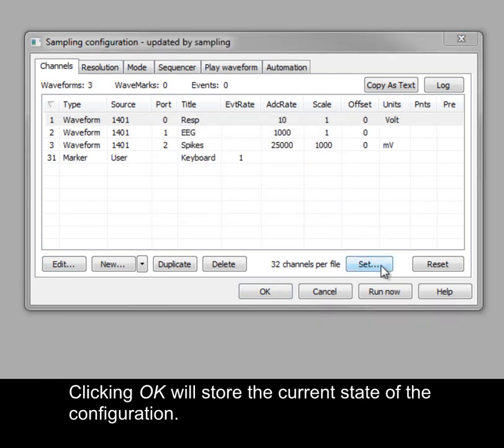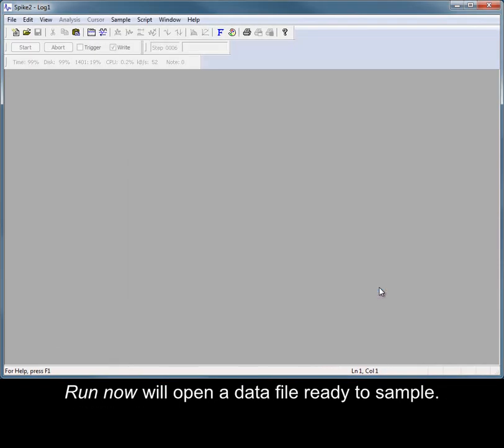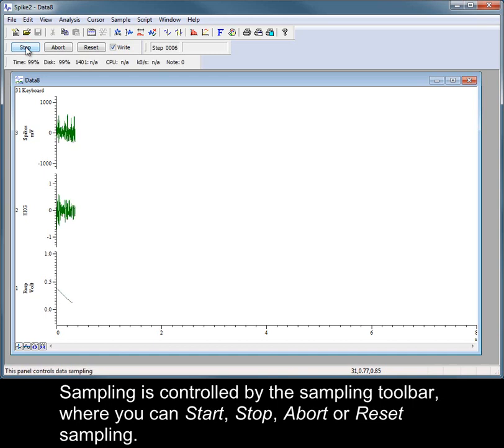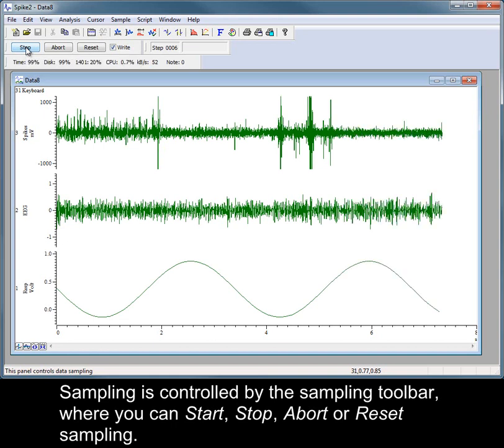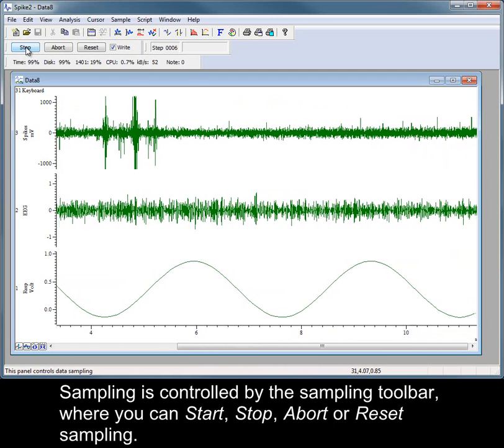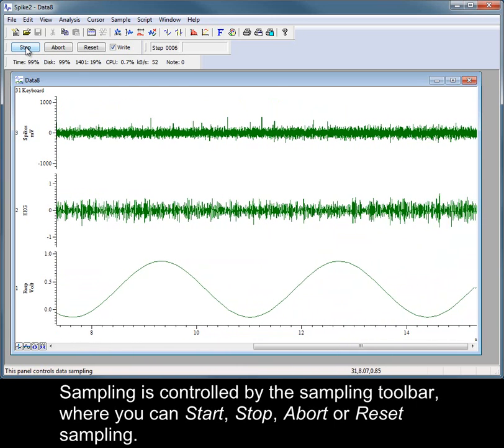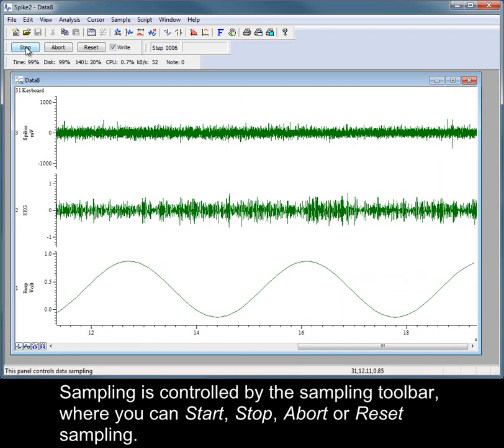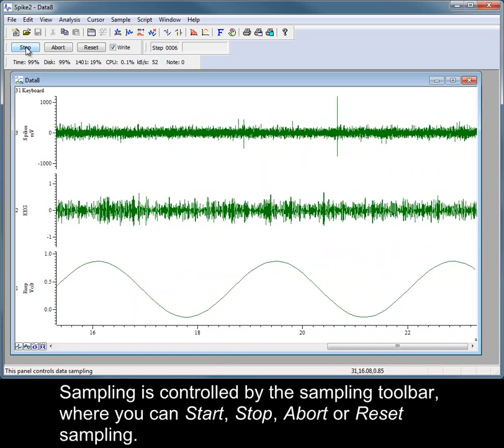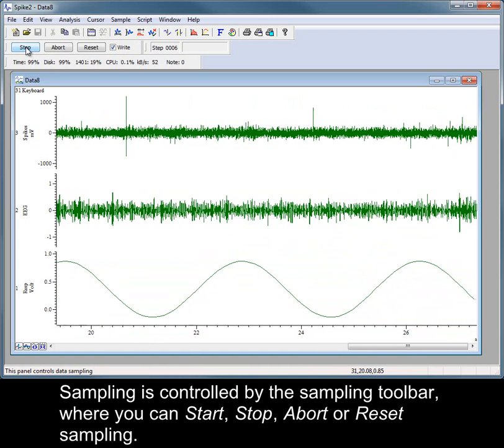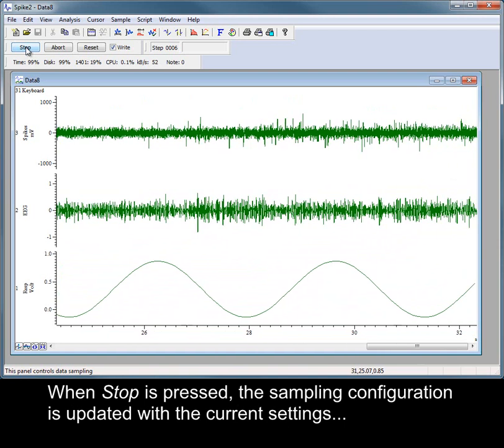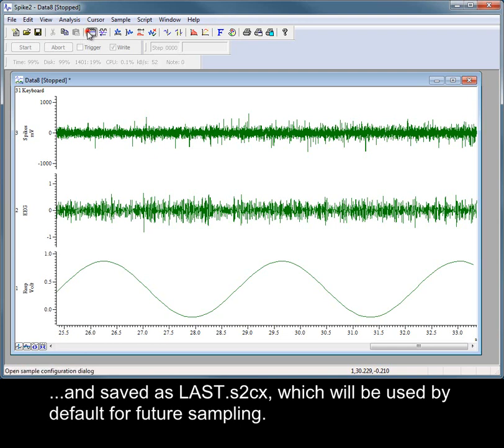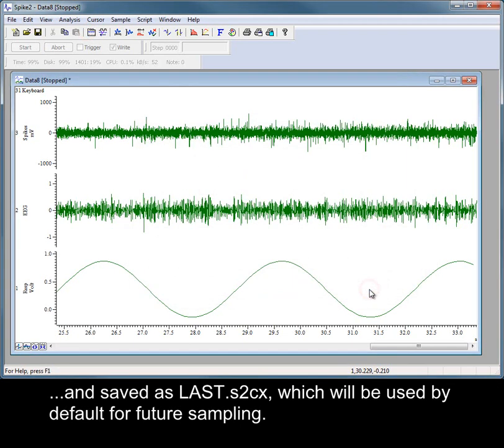Clicking OK will store the current state of the configuration. Run Now will open a data file ready to sample. Sampling is controlled by the sampling toolbar, where you can start, stop, abort or reset sampling. When the stop is pressed, the sampling configuration is updated with the current settings and saved as last.s2cx, which will be used by default for future sampling.